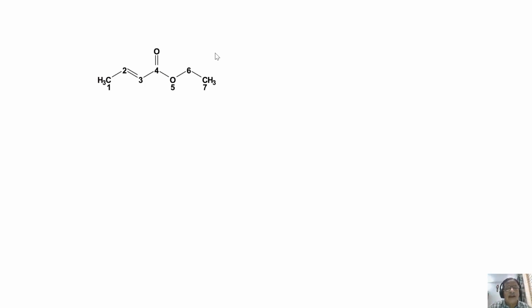For example, take kekulene, or take aniline. A lot of protons are there, but many of them are equivalent, in which case you may have only 1 or 2 types of chemically inequivalent protons. So then what is the point in going to higher dimensions? Choosing higher dimensions is very important.